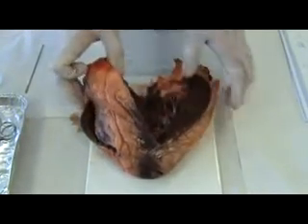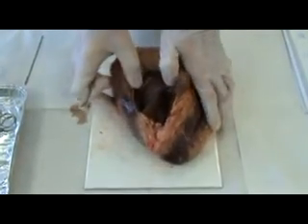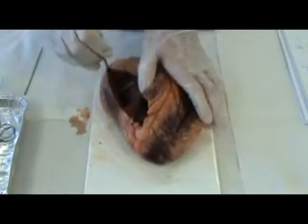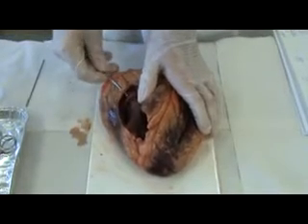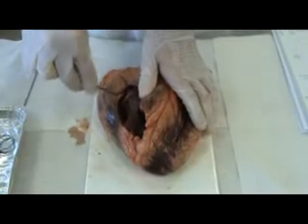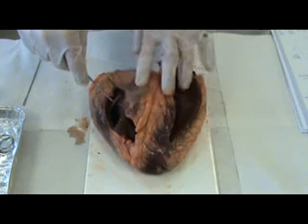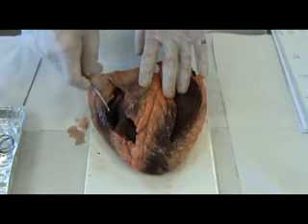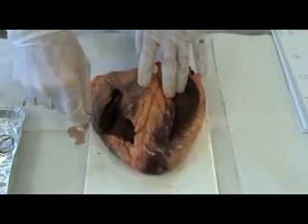We can go further and look at the other side of the heart, and again with your probe you can see the valve there and further chordae tendineae, and this valve would be the tricuspid valve, and it's allowing the blood, when it opens, to flow from the right atrium into the right ventricle, and that fills with blood and stretches.